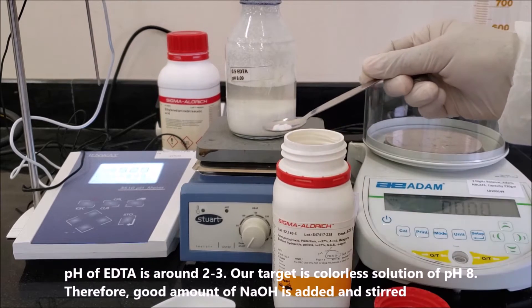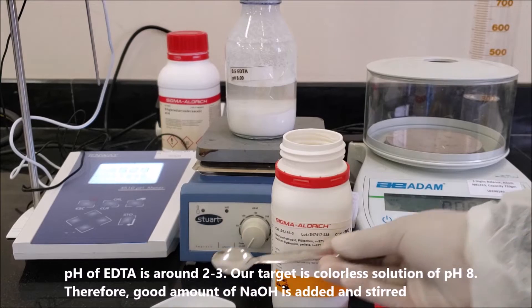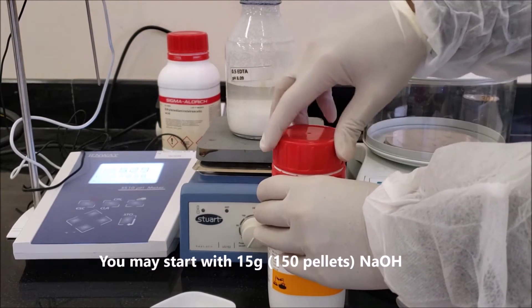Our target is a colorless solution at pH 8. Therefore, a good amount of NaOH is added and stirred. You may start with 15 grams, approximately 150 pellets of NaOH.